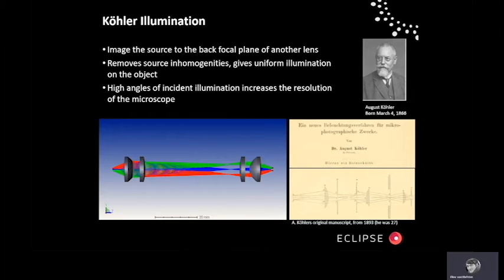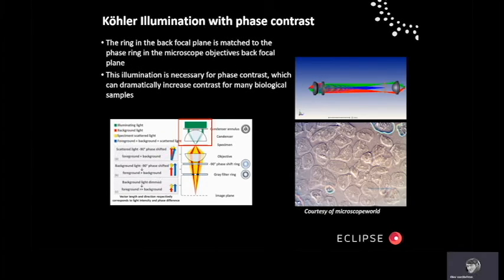And in this way you can also create high angles of incident illumination to optimize the resolution, and there is plenty of room to put in apertures so you can optimize. Phase contrast can also be used with this.